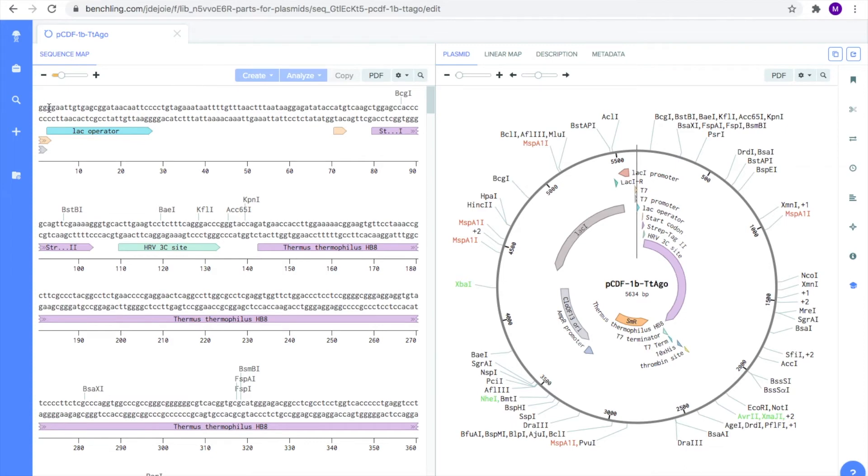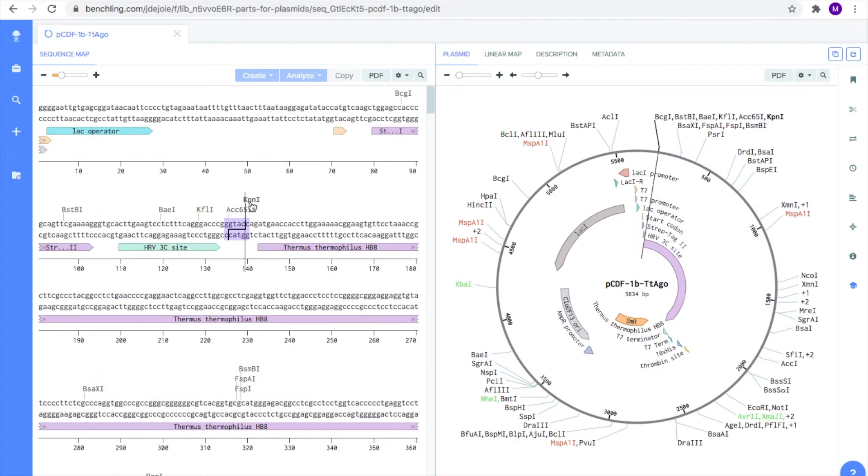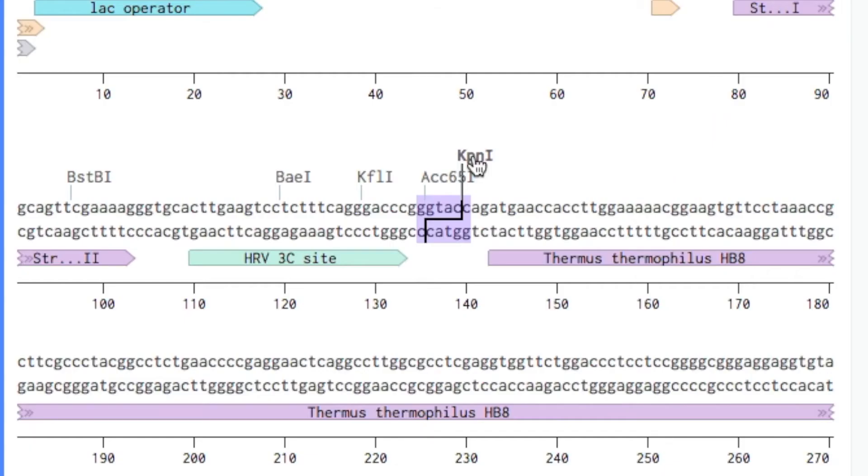Now let's go ahead and scroll to the beginning of our TT-Ago gene on the sequence map. At the beginning of the purple band that represents our gene, there is a restriction site for the enzyme KPN1. If you click on the enzyme, you will see a dark black line and a blue highlighted section. The black line represents how the DNA will be cut, and the blue highlighted section shows the recognition sequence or site for that restriction enzyme. As you can see from the dark black line, KPN1 forms a four base pair overhang, or a sticky end.